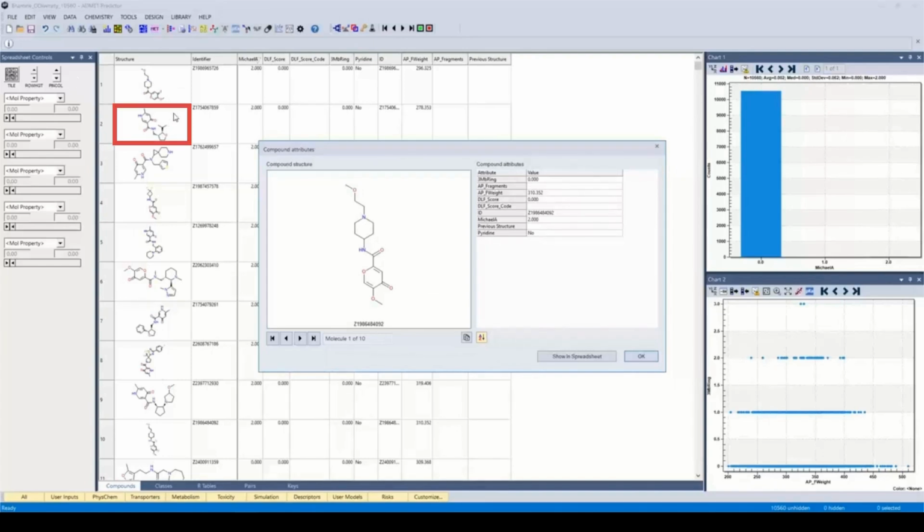Otherwise, you can just select the compound and hit that arrow to scale up the selected set. Here I was able to pretty easily select that 3rd bin, and then we can go through these compounds, and we end up having 10 compounds that at least triggered our Michael acceptor rule, and we can pretty clearly see the alpha, beta unsaturated substructures that were called.